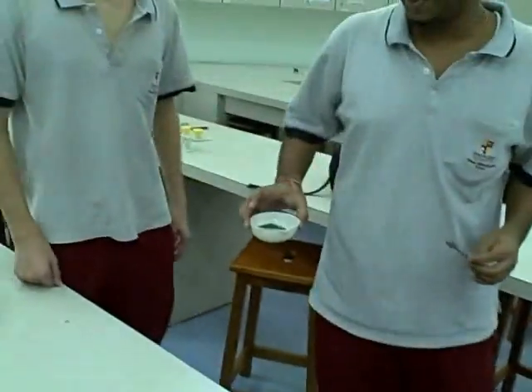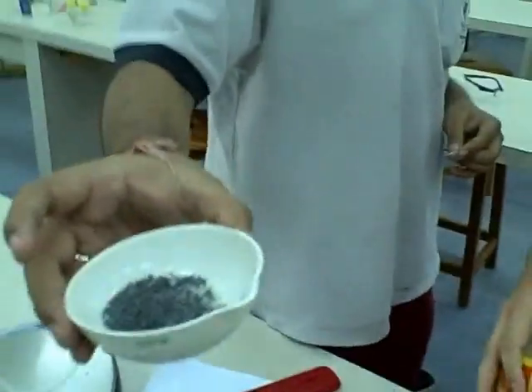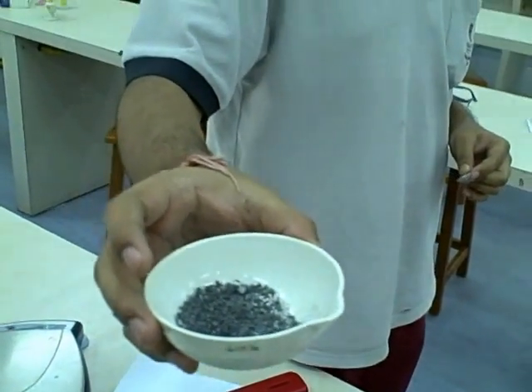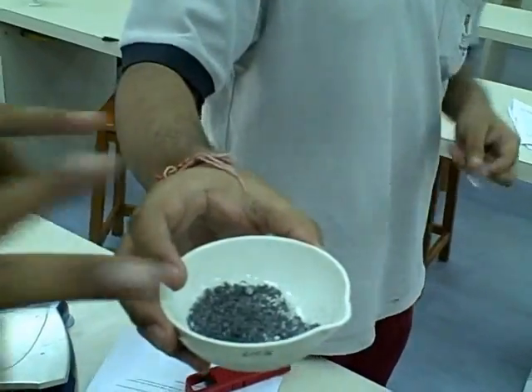Where did you mix it? Here. Okay. There it is. That's ammonium nitrate, ammonium chloride, and zinc together, and we'll catalyze it with water. This is the negative X reaction.